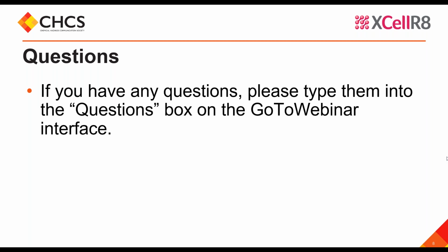For the bottom-up approach, where you would start with skin irritation, that's a more straightforward choice because there's actually only one that's regularly used, and that's Test Guideline 439, using a reconstructed skin model, actually pretty much the same skin models that we talked about today. And the method is very similar, but it's been validated for irritation potential versus corrosive potential. It's using different time points, different reference chemicals, but that would certainly be the go-to method for skin irritation.